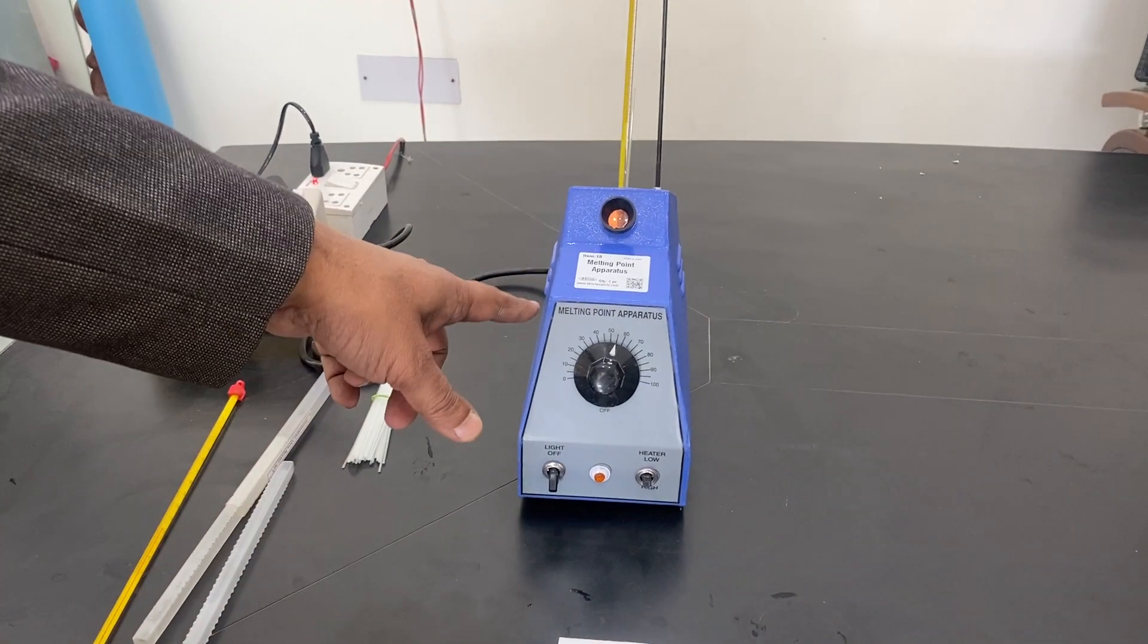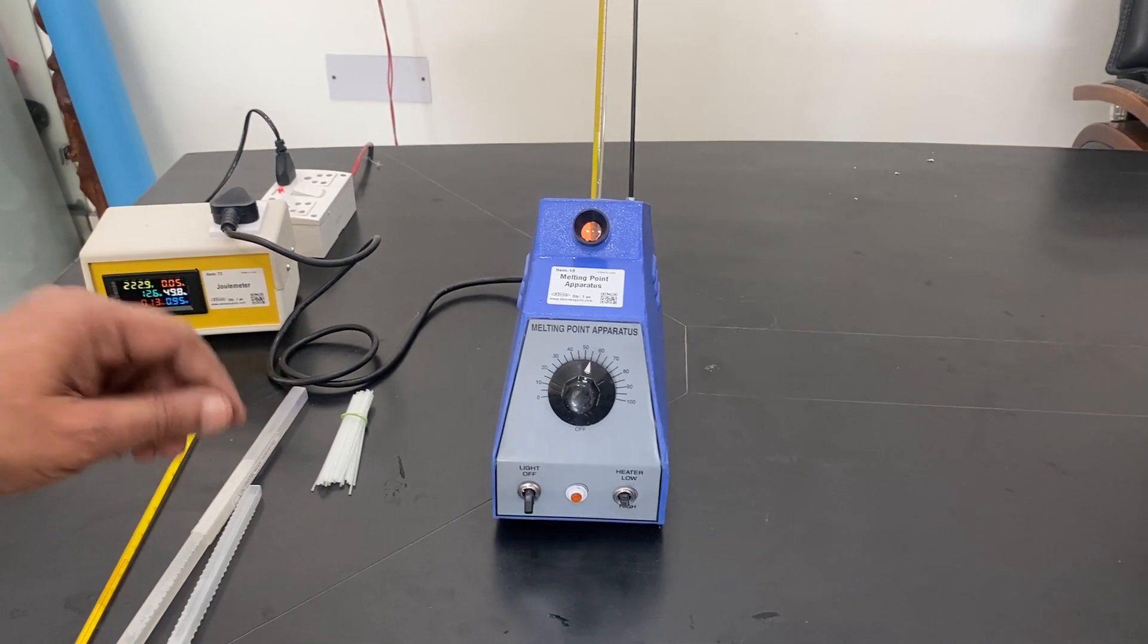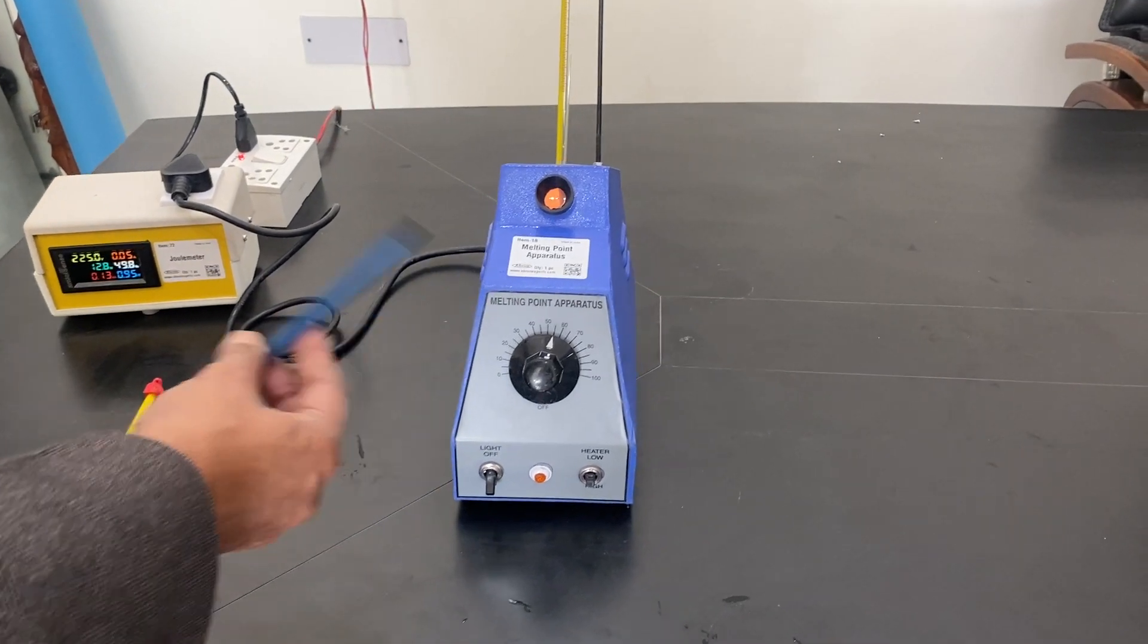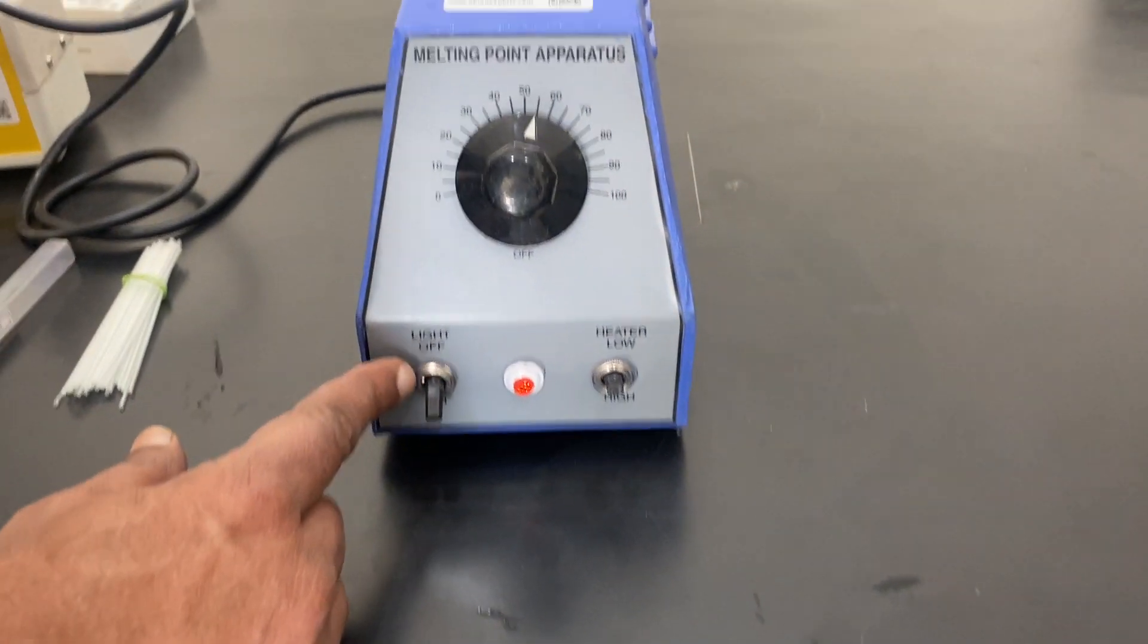This is a melting point apparatus for powders. For solids, you have to make a powder first. This is for checking the melting point manually. This one is the on/off switch.